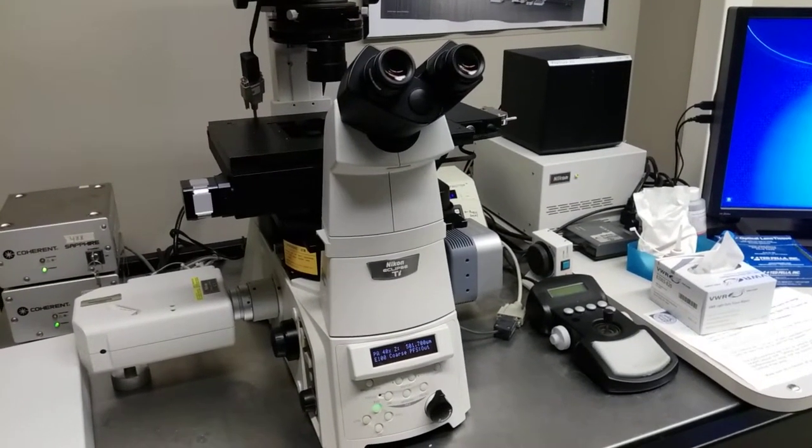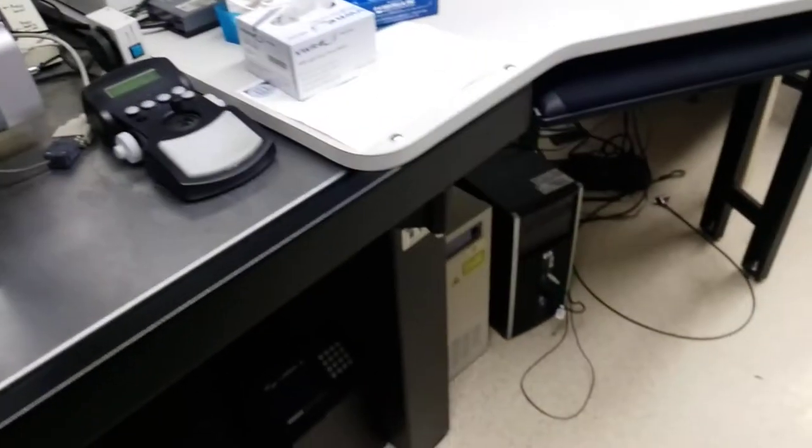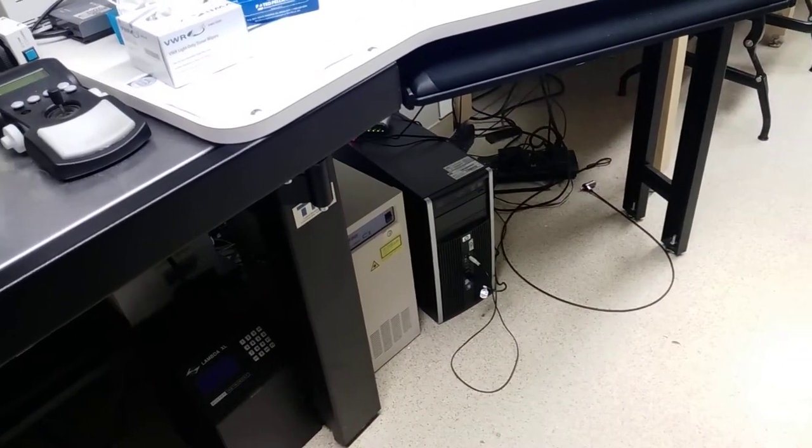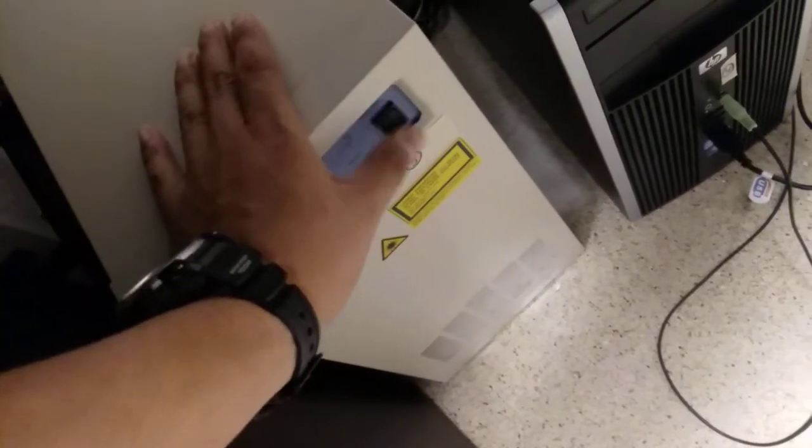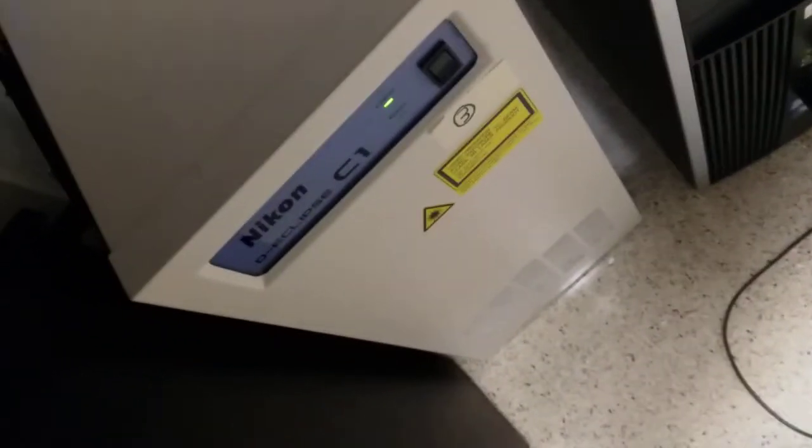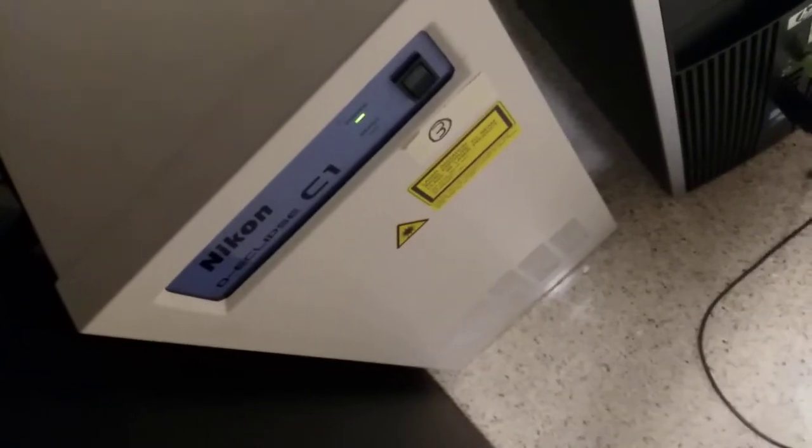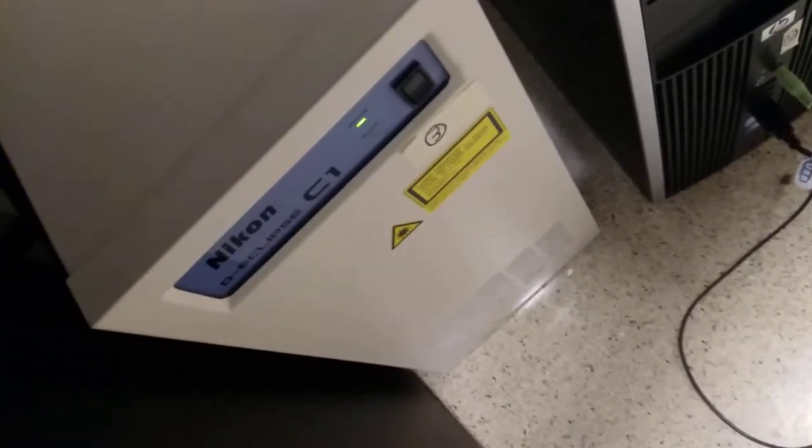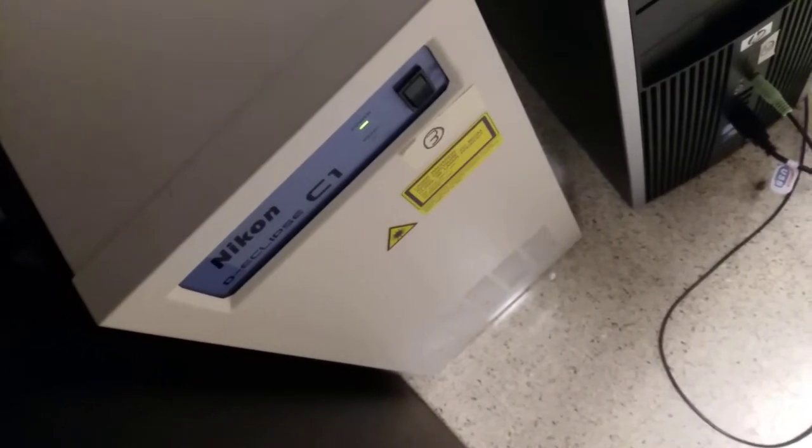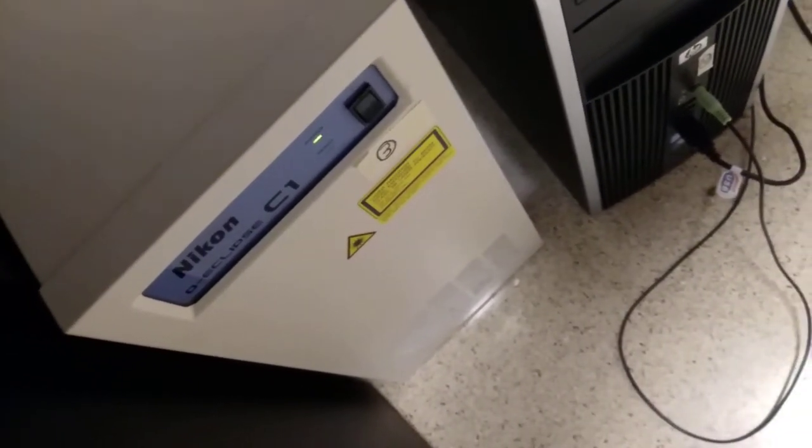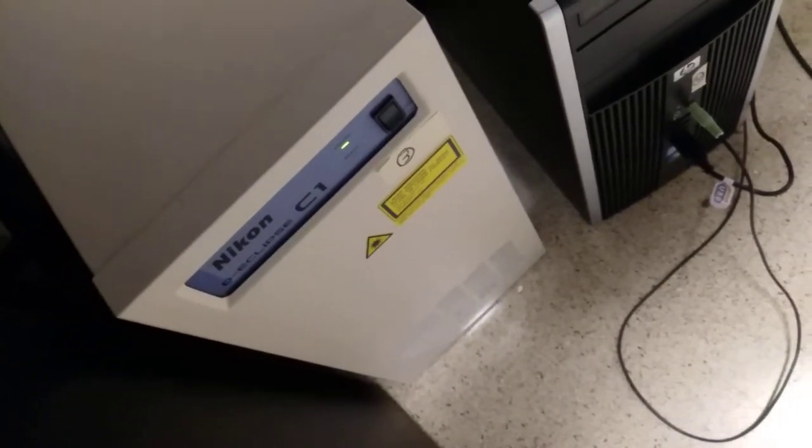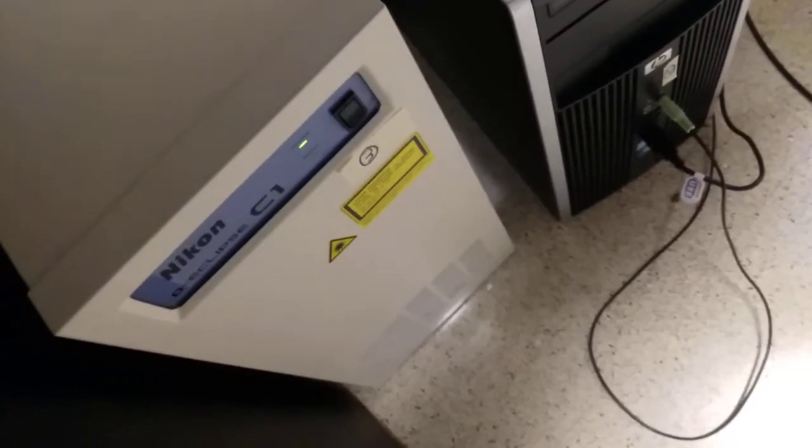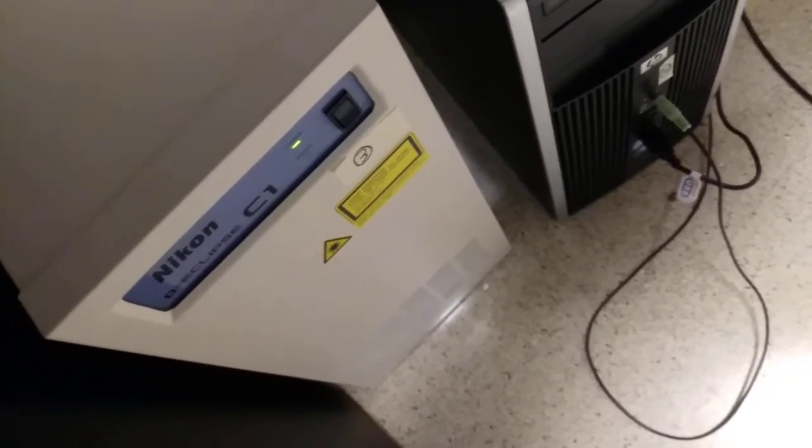Now the next thing you want to turn on is the C1 controller. That's located down here next to the PC. I'm going to go ahead and switch that on right here. What you'll notice is there is one light. That is the power light. The light below it is the ready light. After maybe like 30 seconds, that will turn on and then the C1 controller will be ready to go. While we're doing the next steps, this should turn on.